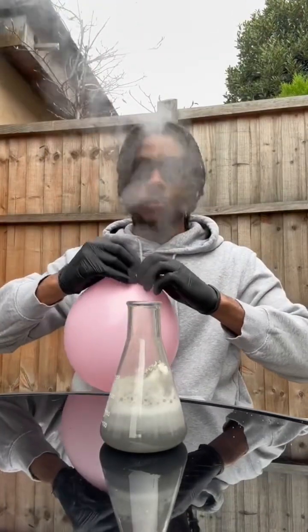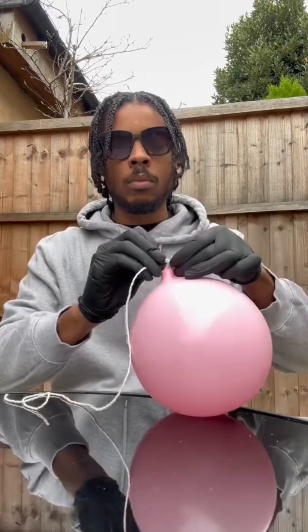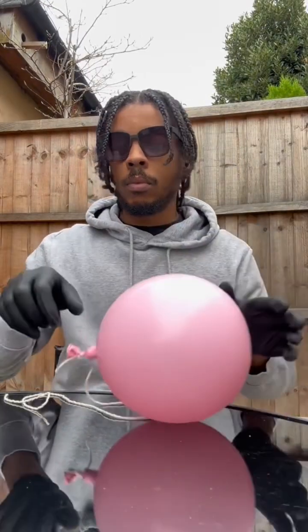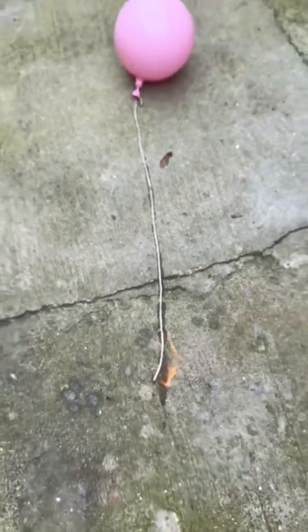Now obviously that's ready now, just going to tie that up. The thing's still bare hot — exothermic reaction, bare heat in that. Alright boom, so I'm going to tie a little string to the end of the balloon and obviously I'm going to light the string and then we're going to blow up the hydrogen balloon and see what happens.